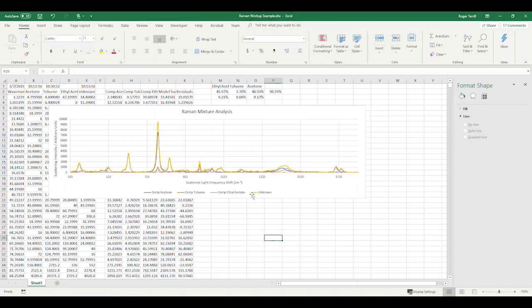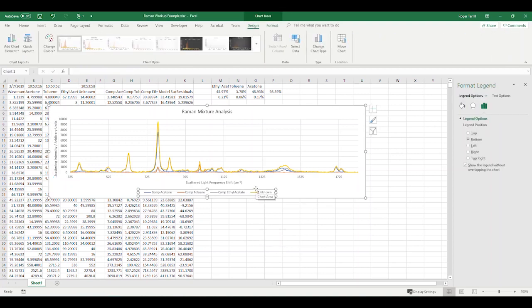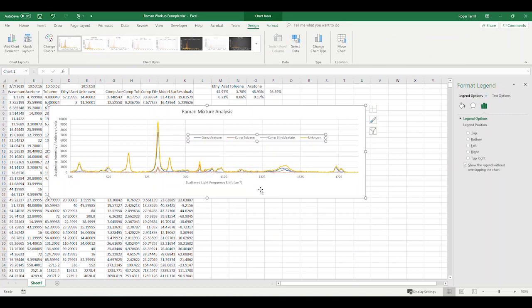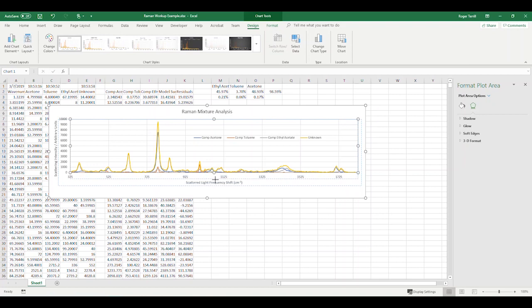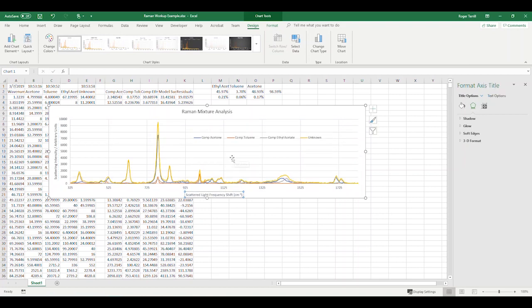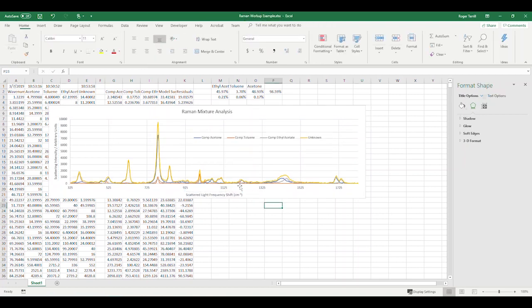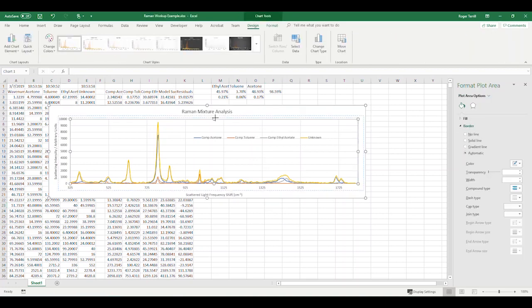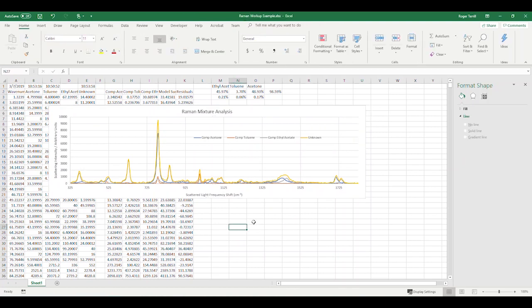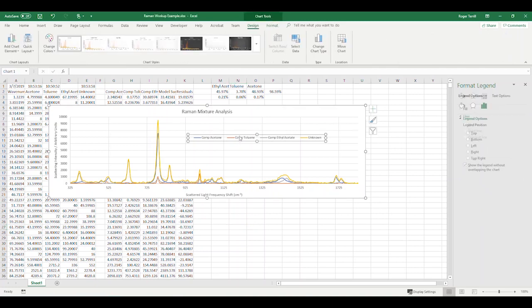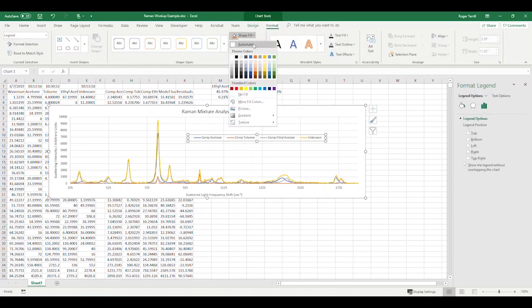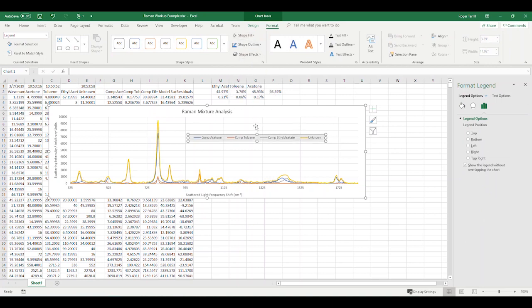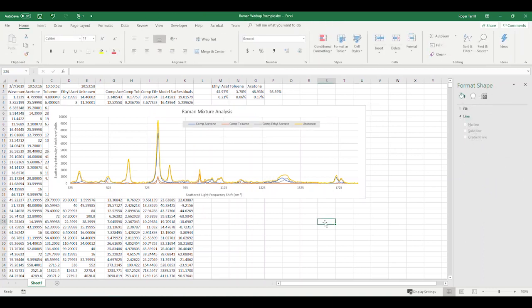So now, I'm going to take this legend guy. Add it to the white space over here. Take this. Expand it a little bit vertically. There we go. And that one is pretty close to done. Just a little bit more there. So that's acceptable. One thing we can do here is we can format this. Give it a fill. That's sort of like, let's give it a nice gray fill there. Okie dokie. Alright. So, there's that guy.